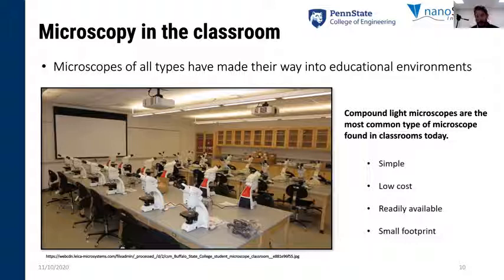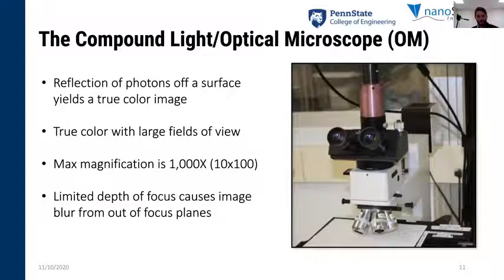Simplicity is obviously important regardless of whether you're using it hands-on or remotely. And as I'll show you today, the scanning electron microscope that we have here is very, very simple to use. So, a quick slide on the traditional light microscope.